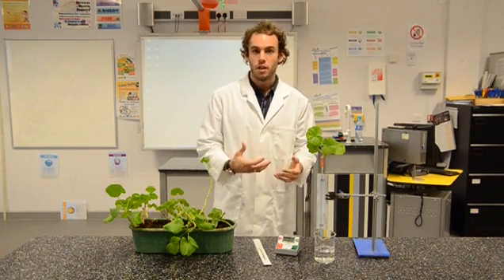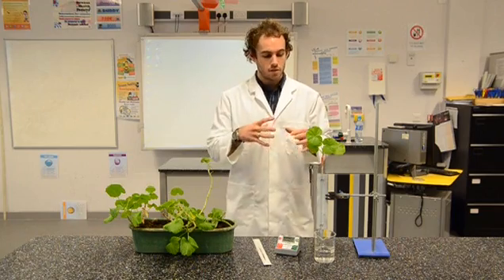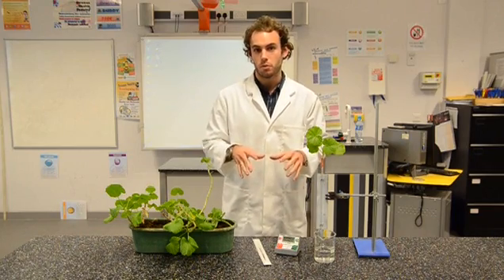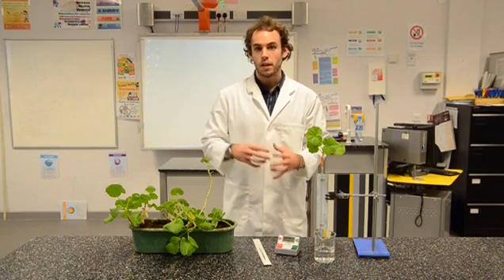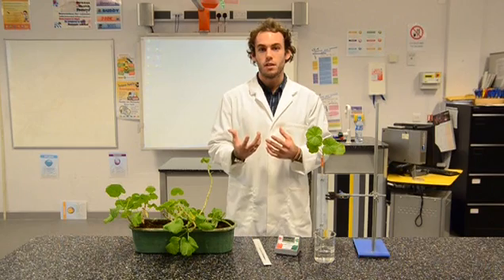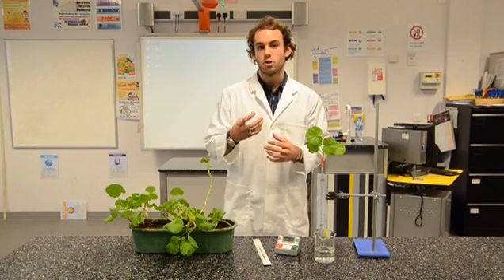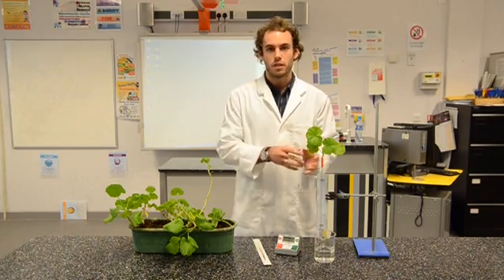Before you get to this stage where you've got your apparatus set up and your experiment running, you obviously have to do a little bit of prep work. The first thing you've got to do is submerge your capillary tube and your rubber connector under water and allow the tube to fill with water. Then you're going to look at your plants and try to choose some leaves which have a stem as close to the diameter of your rubber connector as possible, and I've been lucky enough to find one here.